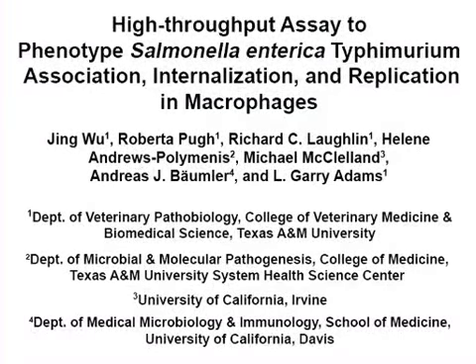The overall goal of the following experiment is to screen and evaluate genes required for invasion and/or survival inside macrophage cells in vitro in a high-throughput fashion and identify mechanistic genes of Salmonella pathogenesis.